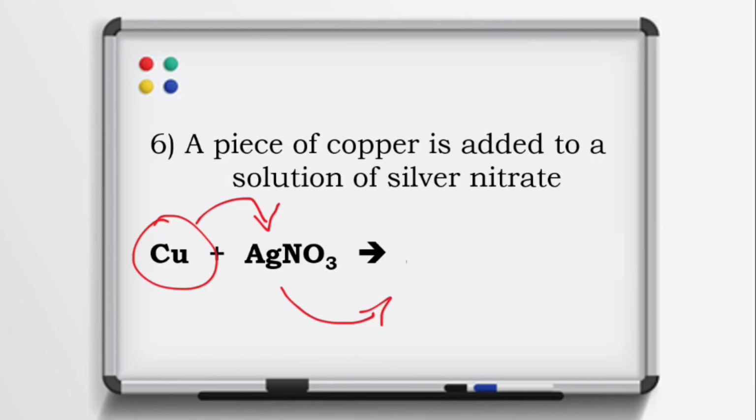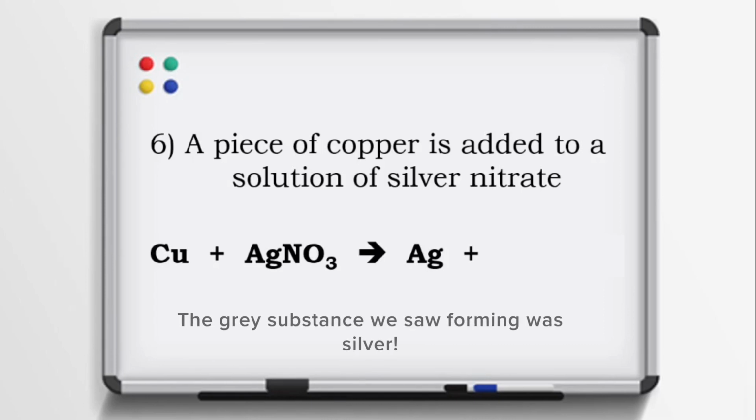So copper is going to come over and break up our nice, stable, happy compound, and it's actually going to be replacing the silver here. That's because they're both metals. They both like to be positively charged. So copper can replace silver in this compound and help complement and cancel out nitrate's negative charge, because we know opposites attract. So silver is going to get kicked out of this compound. Now silver is going to be our single element, and it's not a diatomic, so it doesn't even get a little 2 to keep it company. And now copper is going to be getting with that nitrate.